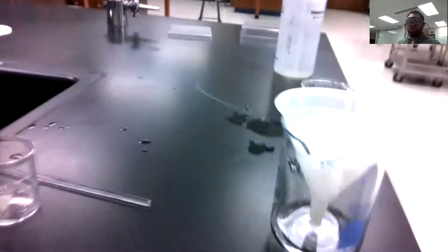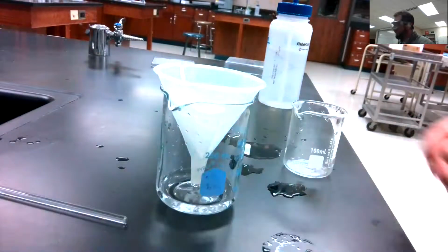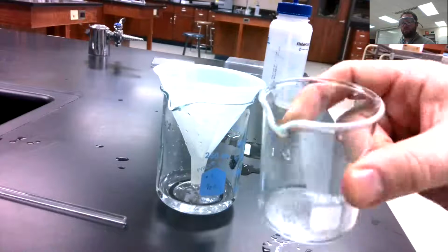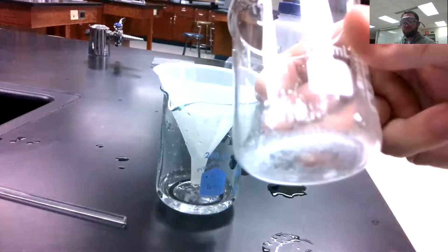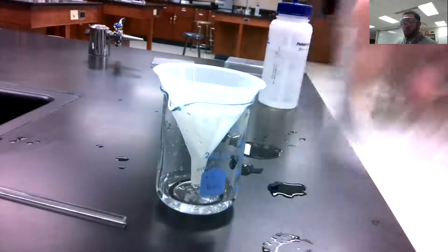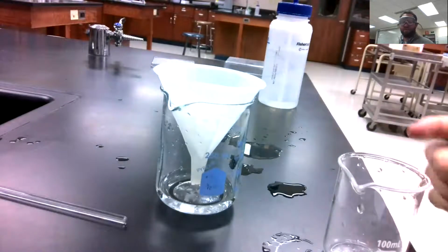Okay. By the minute, working on your stoichiometry. But you'll notice I'm out of liquid in the 100 milliliter beaker. I have poured it all through. It's slowly draining again, but also, hopefully you guys can see, there's still some white residue. Some of our solid product is still in here. I don't want it in here. I want it in that filter paper.